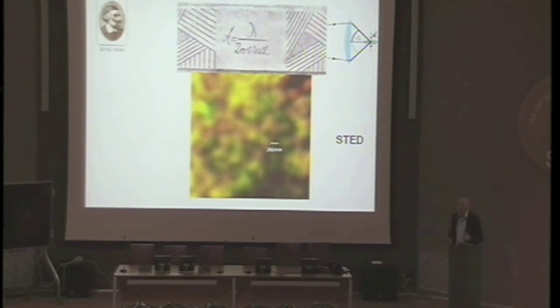Now, the development of STED microscopy, which I'm going to talk about in a few minutes, has changed the notion about what the light microscope can really do. It showed that there is physics in this world, or there is physical chemistry, or whatever you would like to call it. There is a viable way in this world to overcome this barrier, get a much higher spatial resolution, but still maintain the condition of focusing. Just regular lenses and just focused visible light.